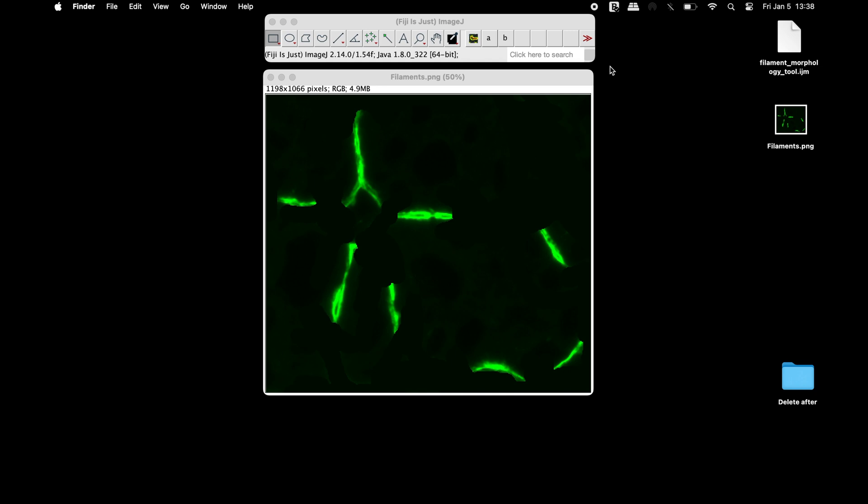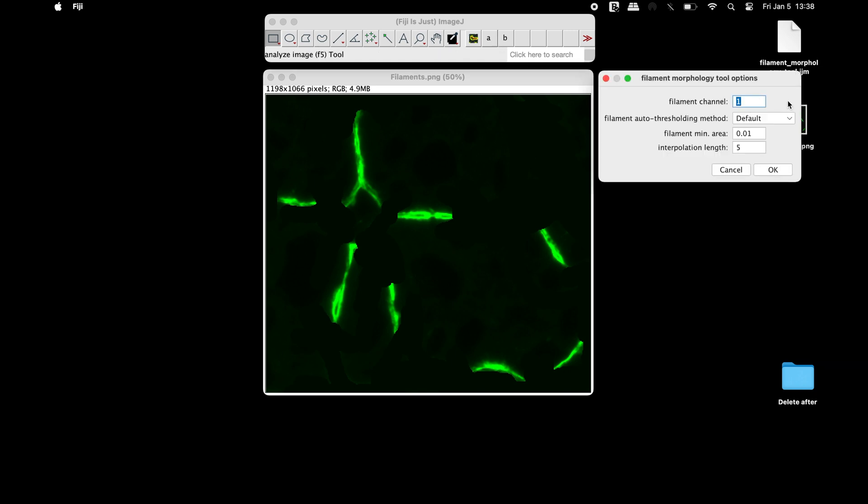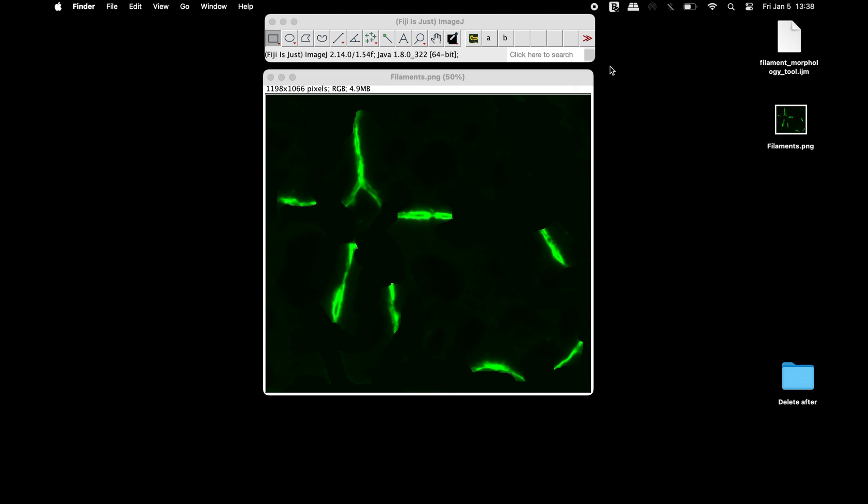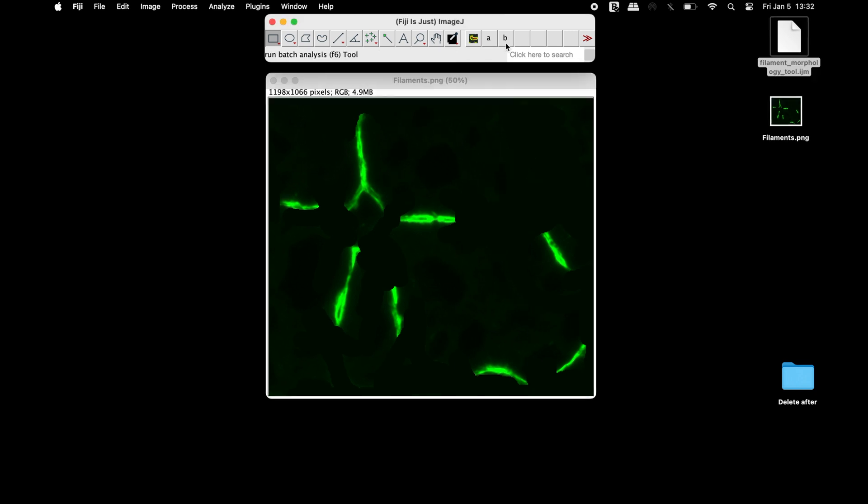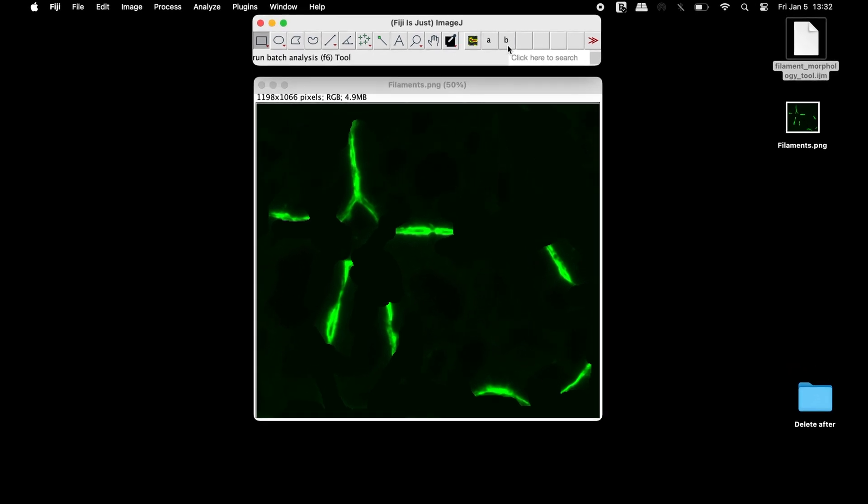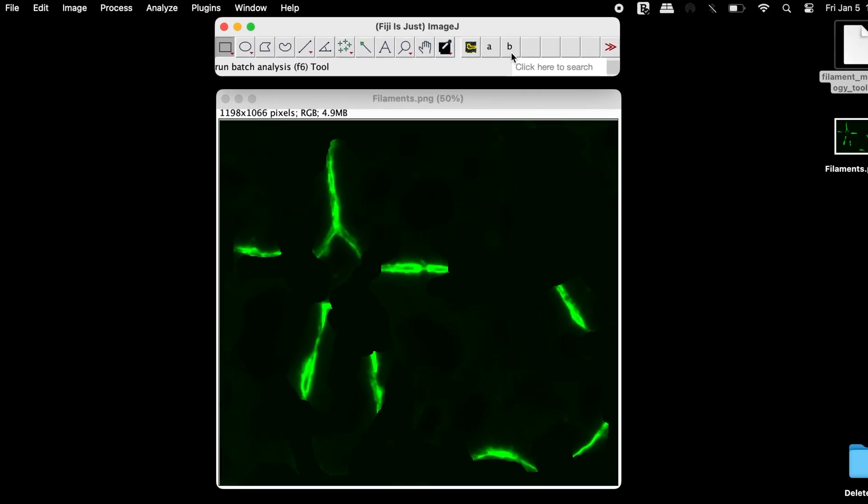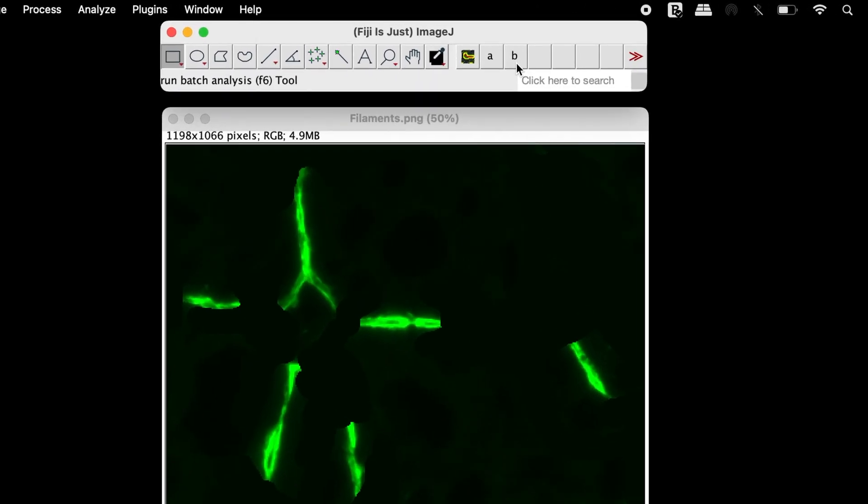The second icon, A, allows users to set the parameters and analyze the active image. The third icon, B, allows users to set the parameters and analyze the images in a batch mode.